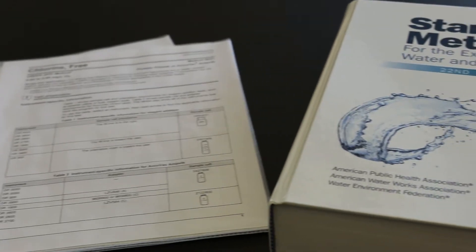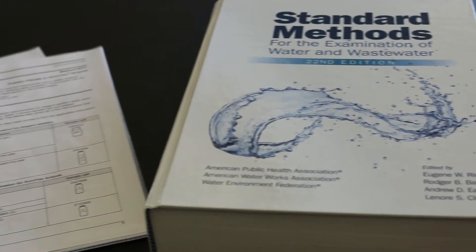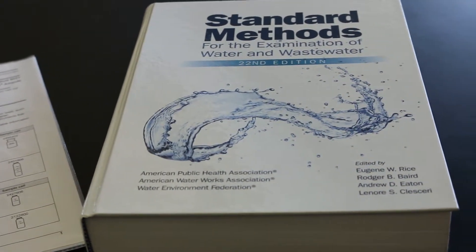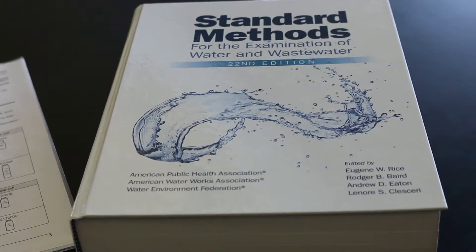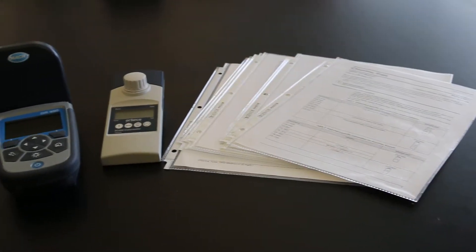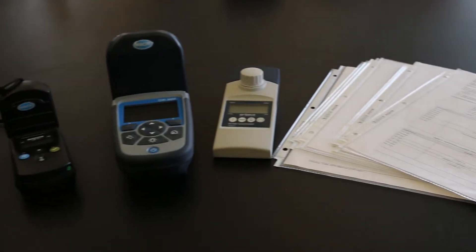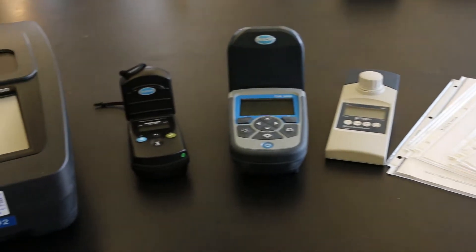The method we are following is adapted from standard methods for the examination of water and wastewater. It is used for testing total chlorine which includes both free and combined chlorine forms found in a drinking water sample.